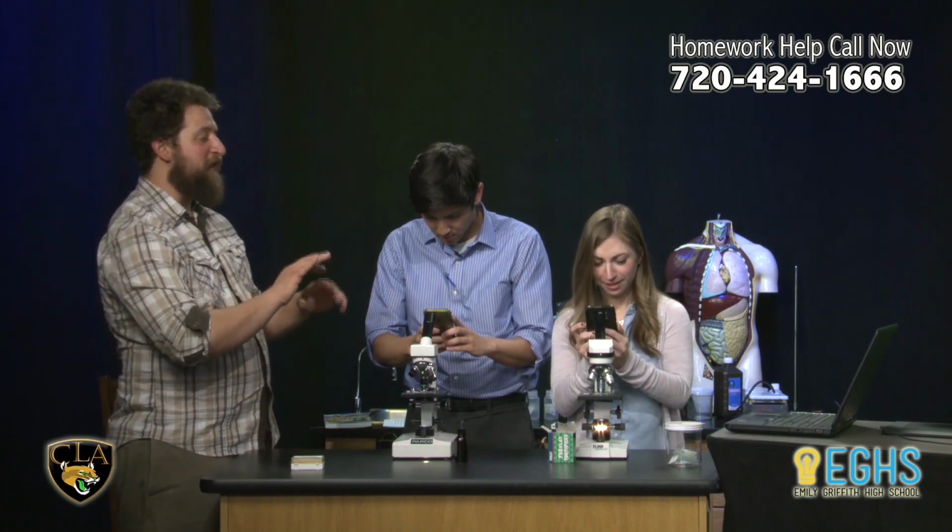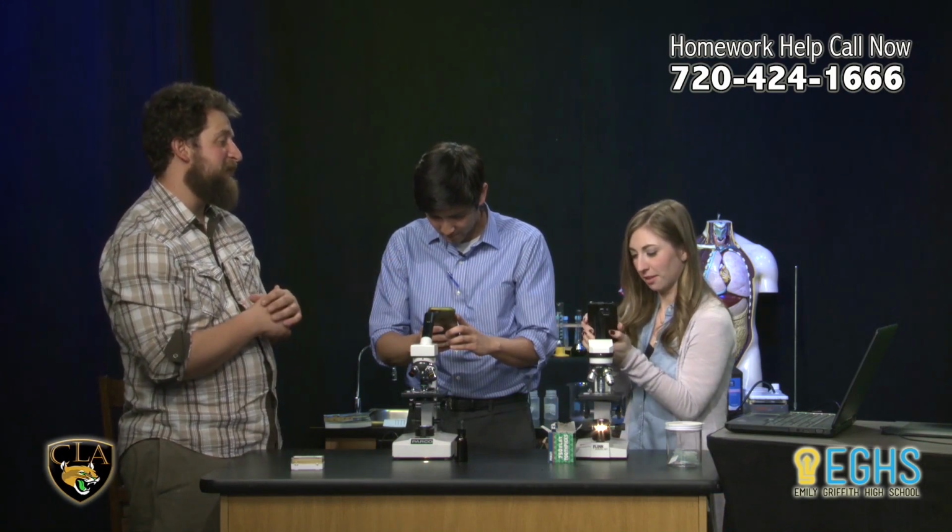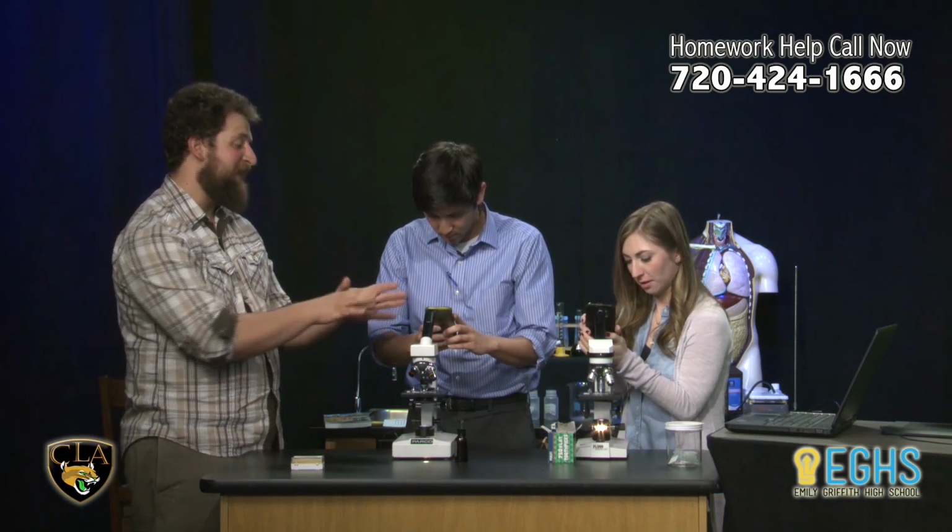So one thing we can also do, if you can just hold it steady, you can get a partner to come over and focus and snap the picture. Oh, there we go. Do you see that, Nate?